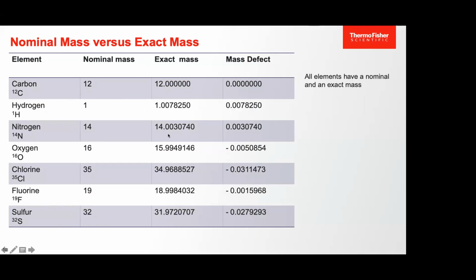Accurate mass, up to how many decimals can you detect? Up to 5 decimal points. It's 0.00782, whereby the first 3 decimal points will be accurate, 0.007. The last 4th and 5th will be variable. So this is how the sensitivity of the system looks like.